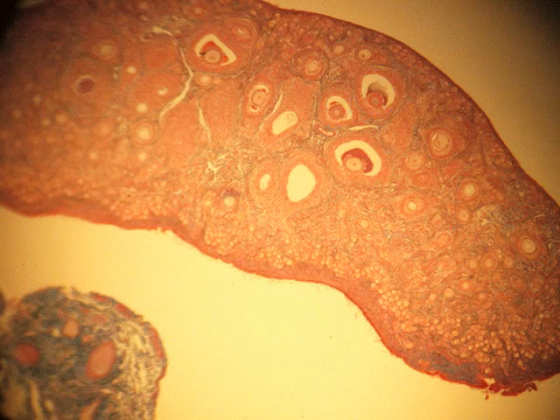It's important that you read about this development of the ovarian follicles in your textbook or go into your lecture notes on this before you start looking at it on the slides. I want you to notice just under the outer covering of the ovary, you see these tiny, tiny little groups of cells. Those are called primordial follicles. And under the influence of hormones from the anterior pituitary, those periodically, and in humans it's once a month, one of these will typically start maturing.